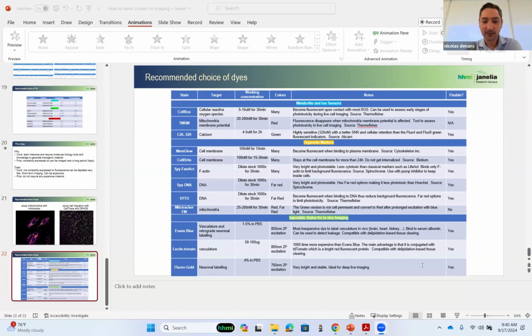And so yes, that's not something I took into account because, again, I have been very privileged during my career, and I had access to whatever I needed. But yes, that's something I need to think about. If we need to think about this database, it's having another column which is the shelf life of the dye and how we can manage it.